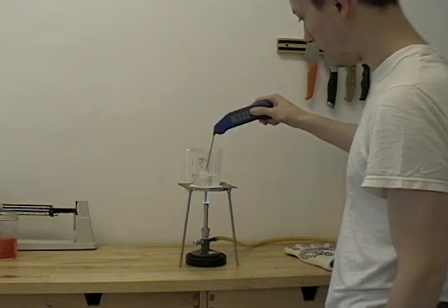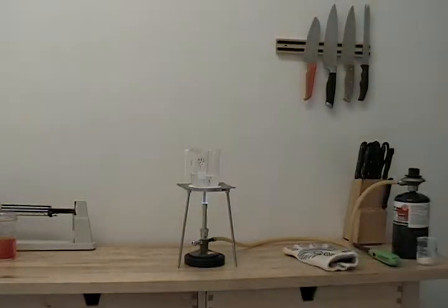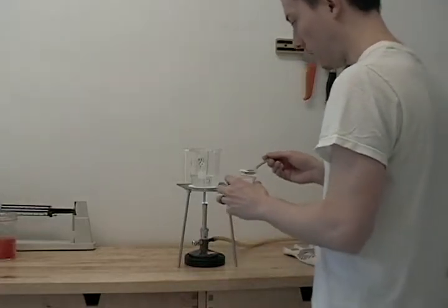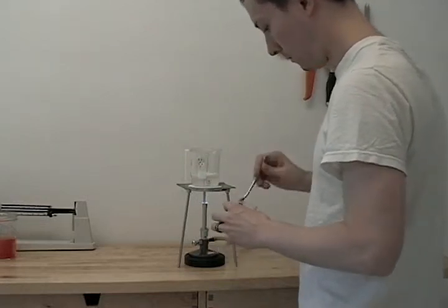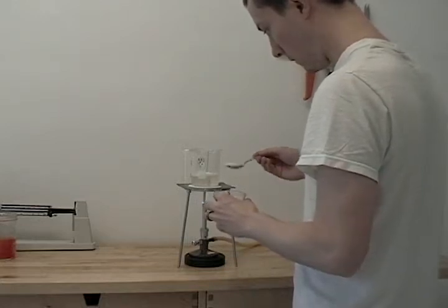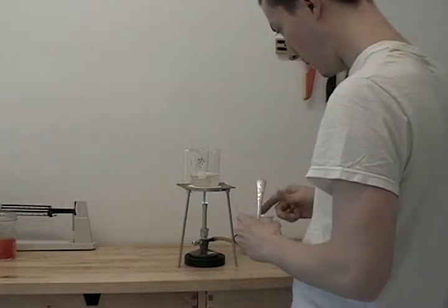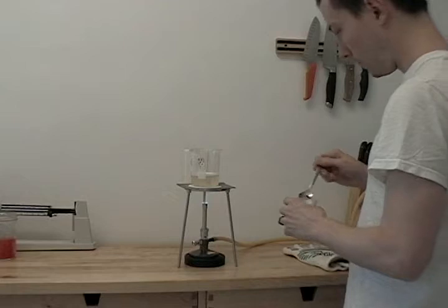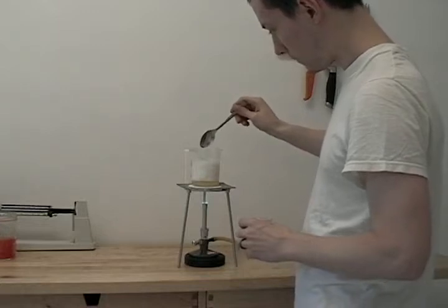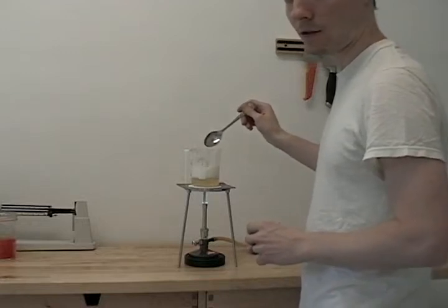We're at about 94 degrees Celsius, so we're almost to a boil. Then we'll be ready to add our dry malt extract. Now we're boiling, so I'm just going to add a little bit of dry malt extract at a time. You can see why I say a little at a time — extreme propensity for boil overs, so go slow.